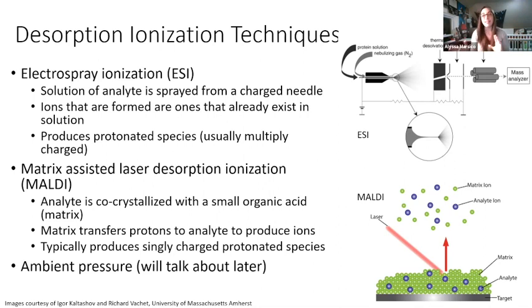One other cool side note about matrix-assisted laser desorption ionization, I keep saying it over and over because I love this technique, abbreviated MALDI, is that much like mass spec is a detector inside of a detector, MALDI is actually an acronym inside of an acronym. Those of you who don't know, laser is an acronym. It's kind of a word now at this point, but it stands for light amplification through the stimulation of electromagnetic radiation. That's what a laser is. So MALDI is an acronym within an acronym, and because it's a mass spectrometer, it's a detector inside of a detector.